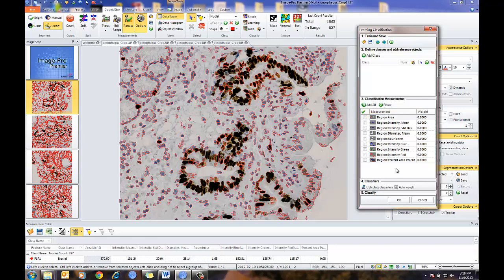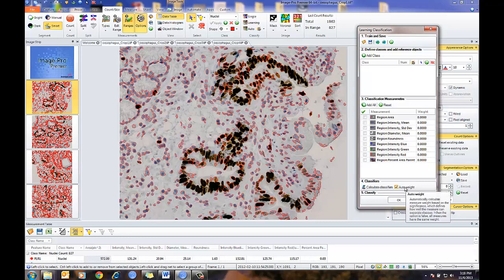From experience, I know that most of my classification is going to be based upon intensity parameters, so I've just selected that subset. Finally, we'll do our classification, where we'll calculate the weighting, statistically separating my different objects into different classes or groupings. It will do an auto-weighting, and then once I have that, I can press OK and that will do the classification.